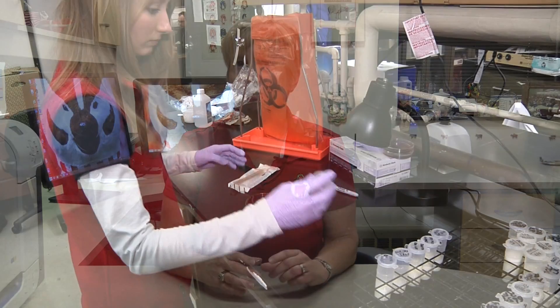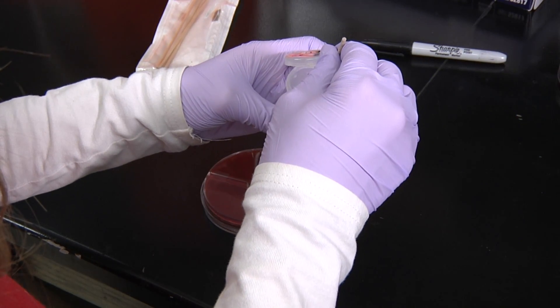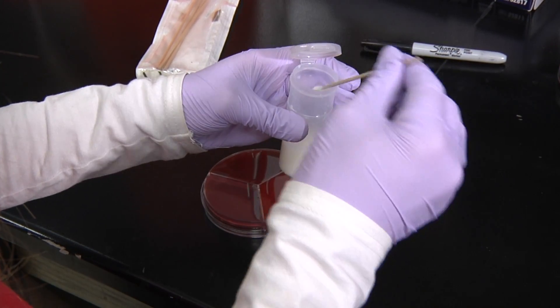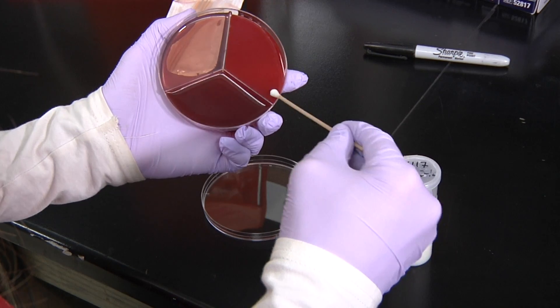After we have the plate labeled, we want to mix our thawed sample by inverting it several times. The purpose of mixing is to make sure that the bacteria in that milk sample are evenly distributed so that when we dip our swab into it, we have a good chance of catching them. We then take our sterile swab, dip it into the milk, and leave that swab in there for about three to five seconds so it has time to absorb the milk. We then take the swab out and gently spread it over the top of the agar segment of the culture plate using the technique that we're showing. Our purpose is to distribute that milk across the top of the agar so we can spread out any bacteria that happen to be in there and identify them after the incubation period.